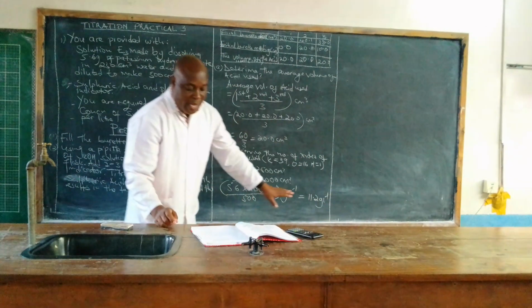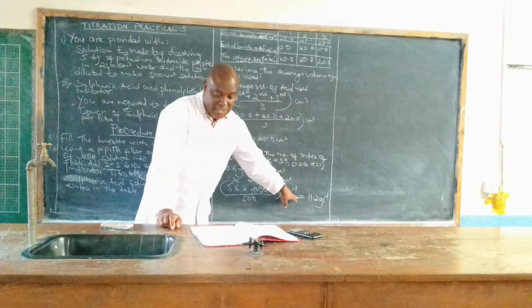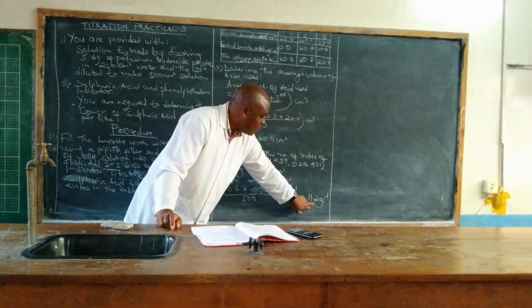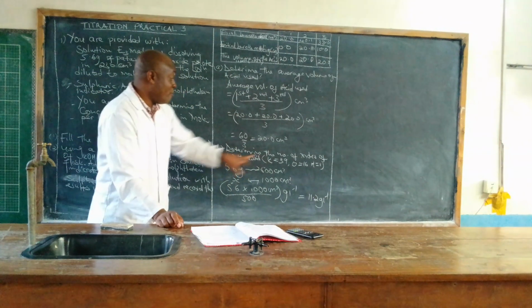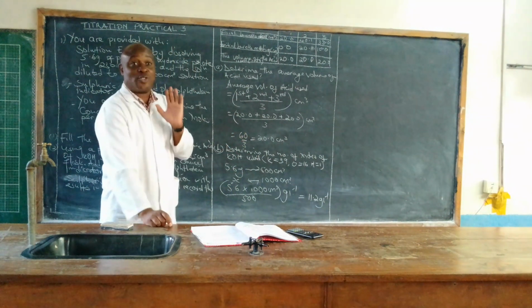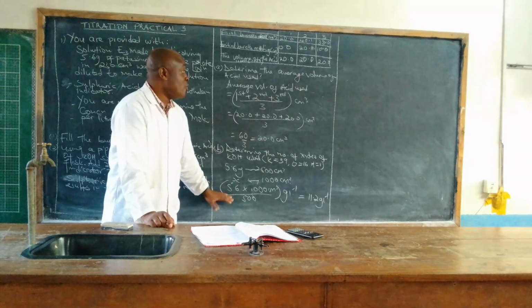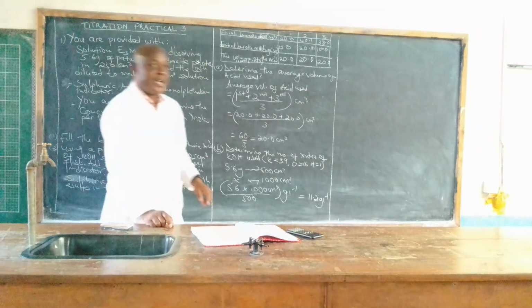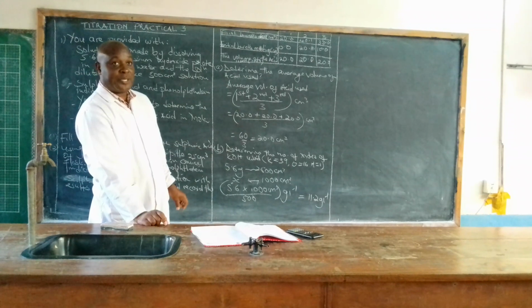Remember, we have only found out the number of grams. We have not determined the number of moles yet. We are still just on the way, right? So you are supposed to follow carefully so that you don't get lost. In the long run, we must first get the relative formula mass of potassium hydroxide.